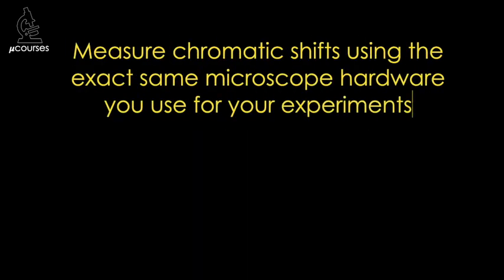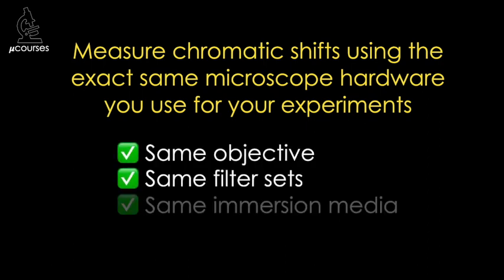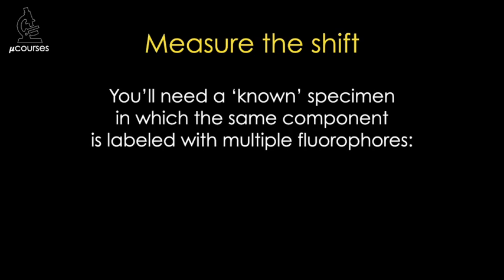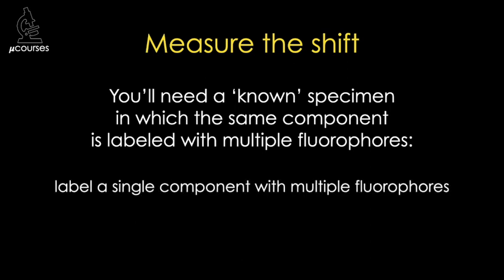Because chromatic shifts have several different sources, it's best not to take any chances. Measure chromatic shifts using the same exact microscope hardware you use for your experiments. To measure the shift, you'll need a known specimen in which the same component is labeled with multiple fluorophores. One option is to label one of your own specimens this way — say, by using a mix of two or more different secondary antibodies with a single primary antibody, and your standard specimen mounting conditions. This type of specimen, because of its similarity to your experimental specimen, may yield the most accurate measurement.